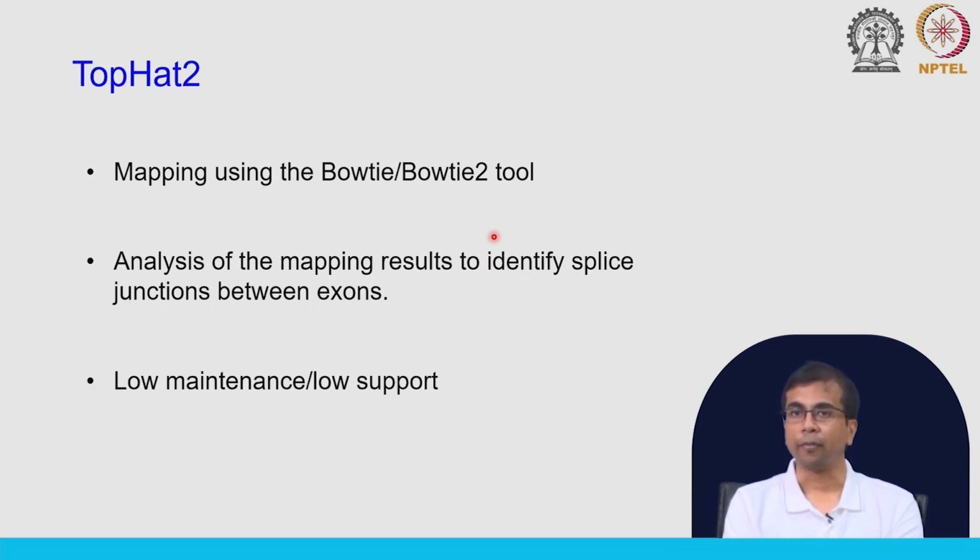Currently it is not maintained anymore. So, this is something that we will not use, and even the authors recommend using the HISAT2 tool, because HISAT2 also combines some of the features from TopHat.